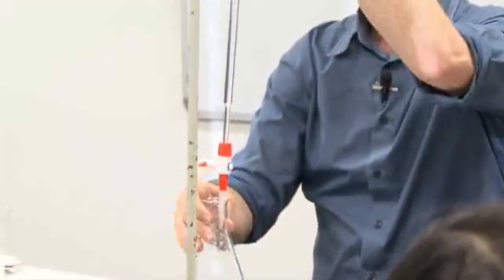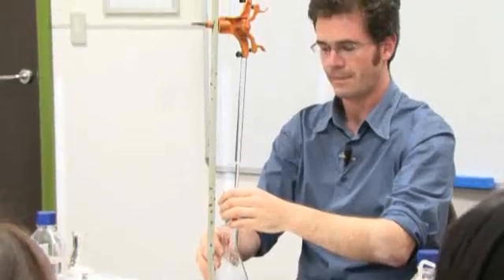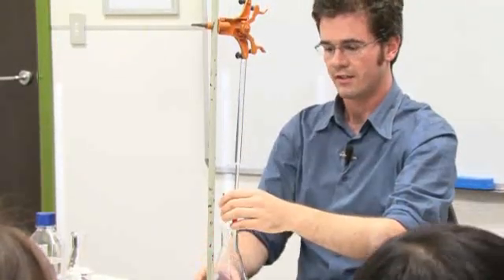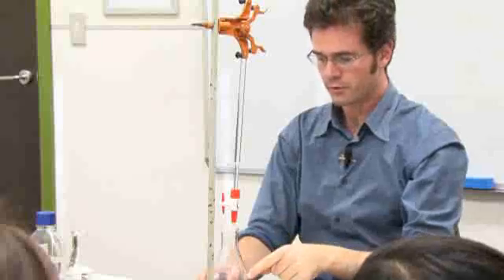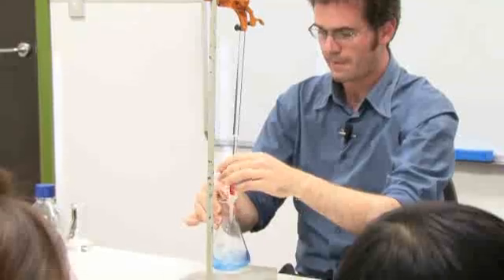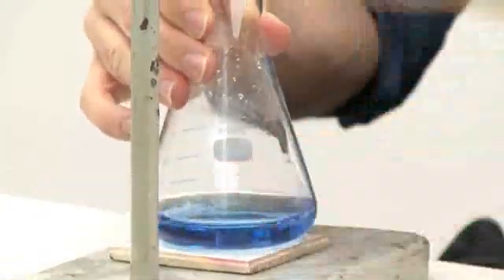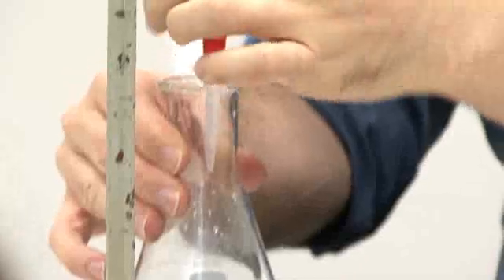Now you can sit down, it'll stand up, it doesn't really matter. When you're conducting your titration, the most important thing to do, especially for your first run, is actually not to watch the volume, but to watch the color in the flask. While it's running, you swirl, you conduct, you just do it quickly. It's your first rough one. You turn it off, give it a swirl. Now, because we've got a large excess of base in here, and we're adding acid, at first you don't see any color change. The solution's blue the whole time.